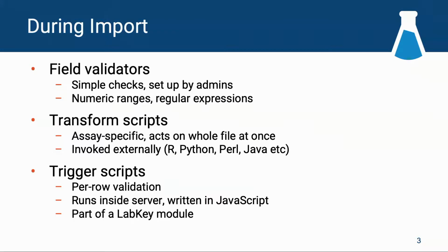Probably spend the least time here on the import side. I think a lot of the other talks have touched on some of these capabilities, but there's a lot of different things you might want to do to either flag data as suspect or just outright reject it, so it doesn't make it into LabKey Server because the problems are so bad. One thing that we've really iterated on with a lot of groups is when to outright reject and when to be tolerant and import, and maybe have a report that says, here are things that are potentially problematic, but it's better to capture that data instead of saying, nope, we're gatekeepers, we're keeping it out, and then people get frustrated and never import it.